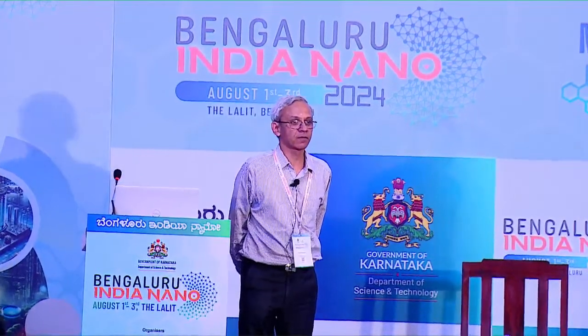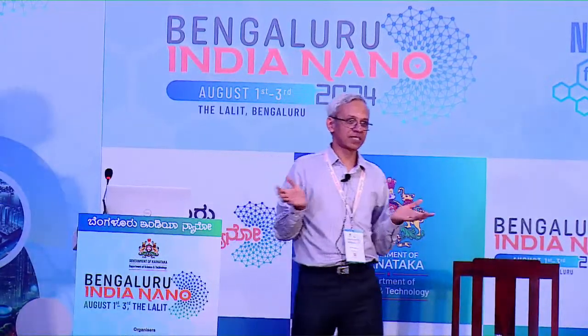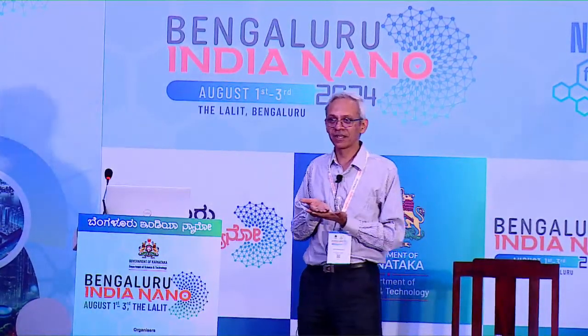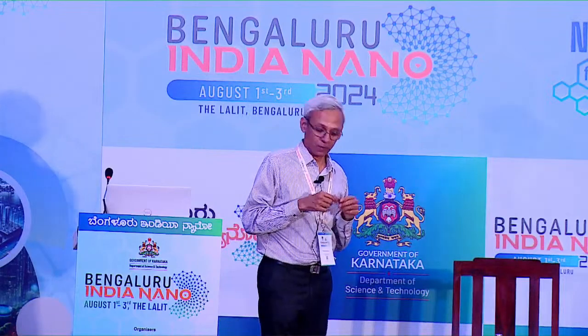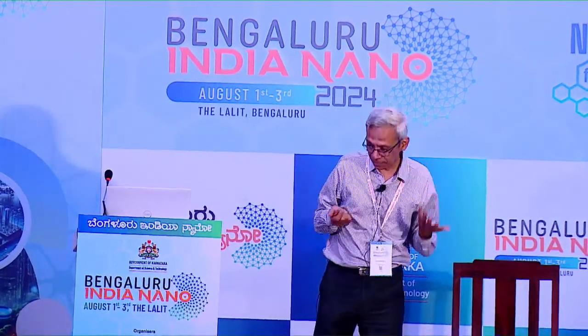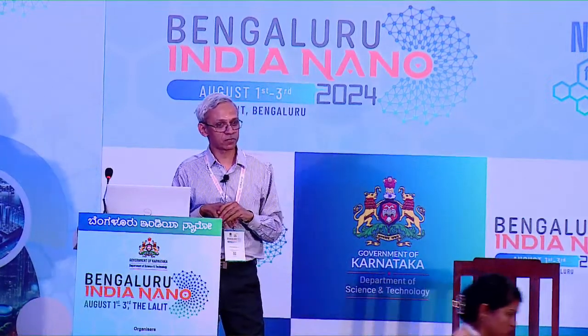After this very nice talk on Raman by Chandrabas, I think he set the stage quite nicely. The last but one slide that he showed, where he showed mixed states of solids and non-mixed states, and we use a laser beam, you're not going to see the difference at all. Both of them are going to look identical. That sets the motivation that we actually want techniques that can show things at a much better resolution, at a much smaller scale, and that is where electron microscopy comes in.